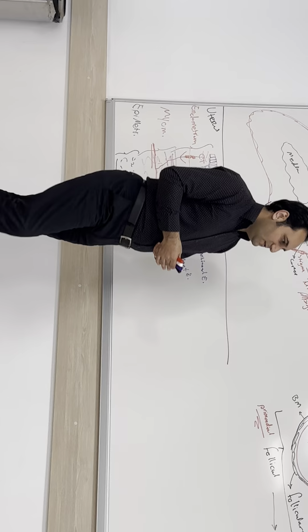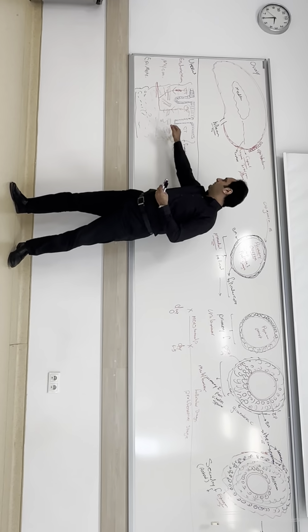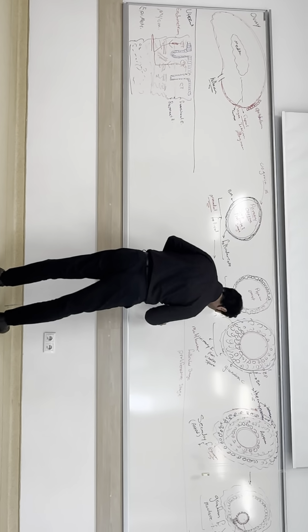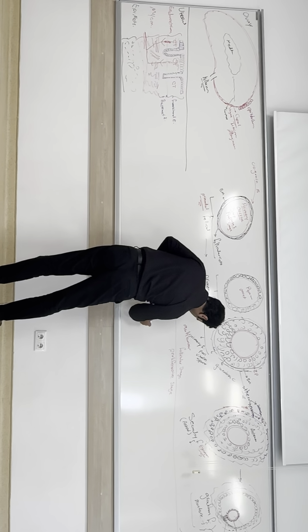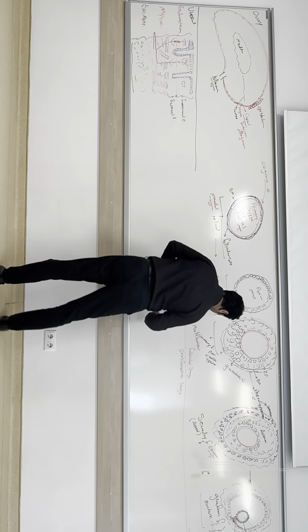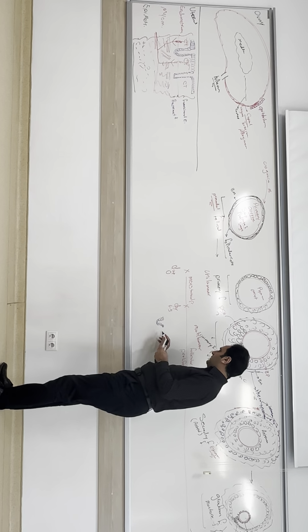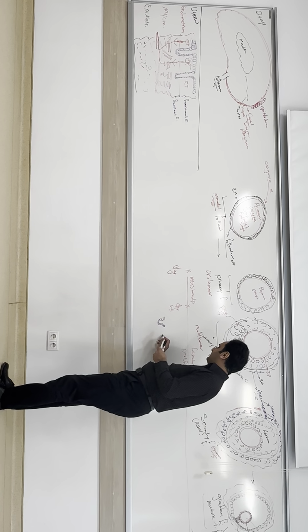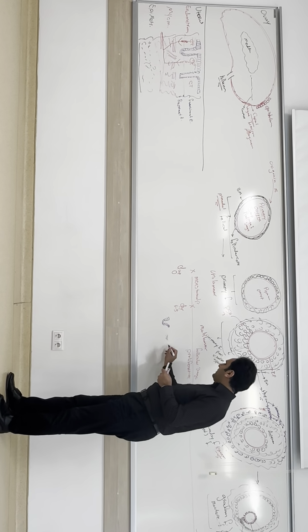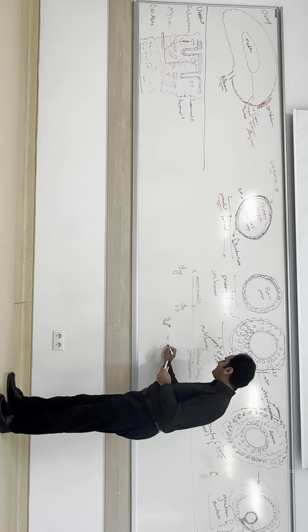With the end of the menstrual cycle, our basement compartment of endometrium is ruptured in the epithelial side and has only, in some parts, the epithelial structure and only the basement part of the glands.